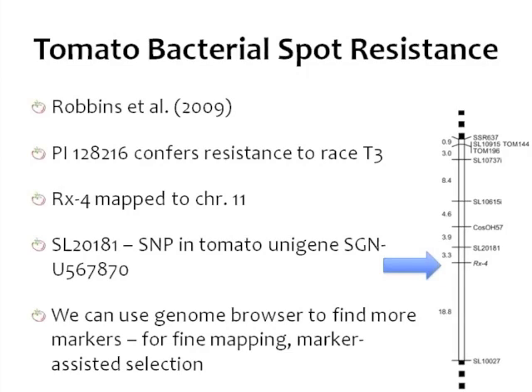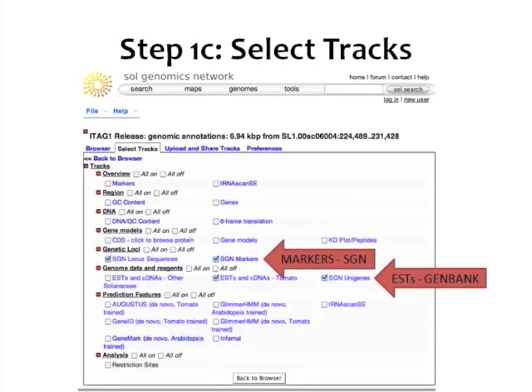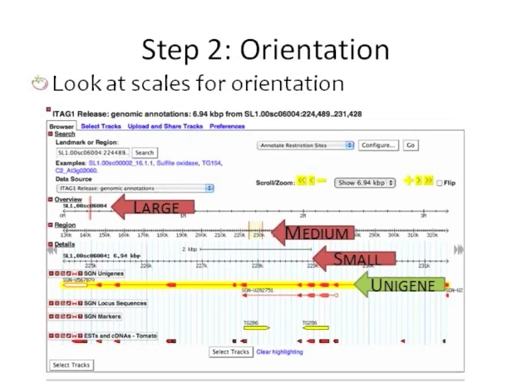So the question is: how can we use the Genome Browser to help us find more molecular markers? Maybe we want to fine map this gene, or find a marker suitable for marker-assisted selection. Step one — here's the top area of our genome browser. We're going to type our unigene into the search box. As our data source, we're going to look at the annotated genome — the ITAG1 release genomic annotations. We select which tracks or types of data we'd like to view, and then do our search. In this case, I selected molecular markers on SGN and ESTs from GenBank.